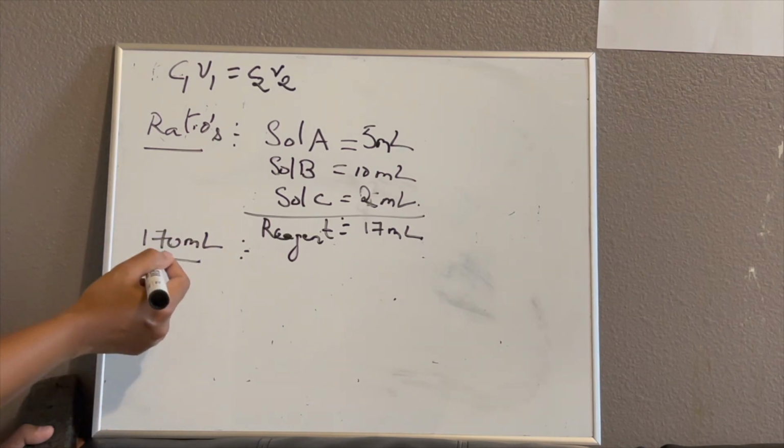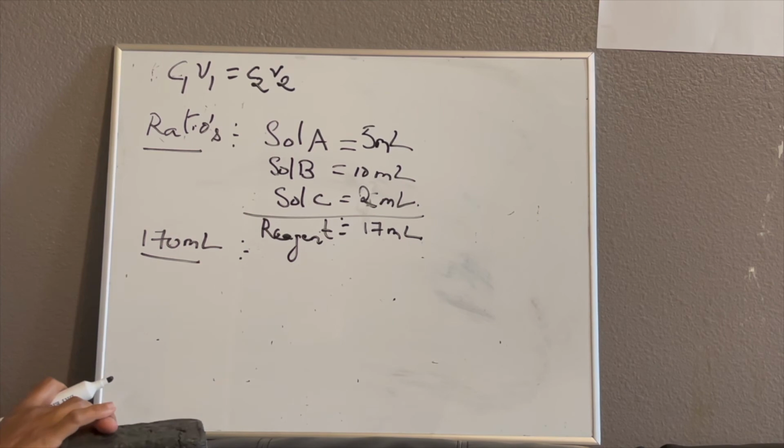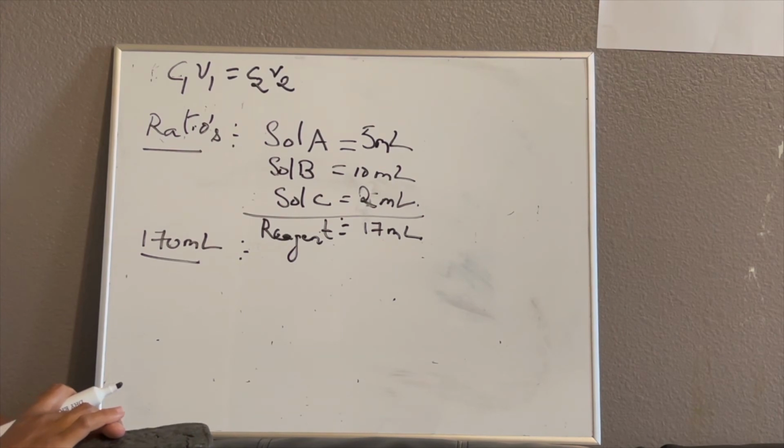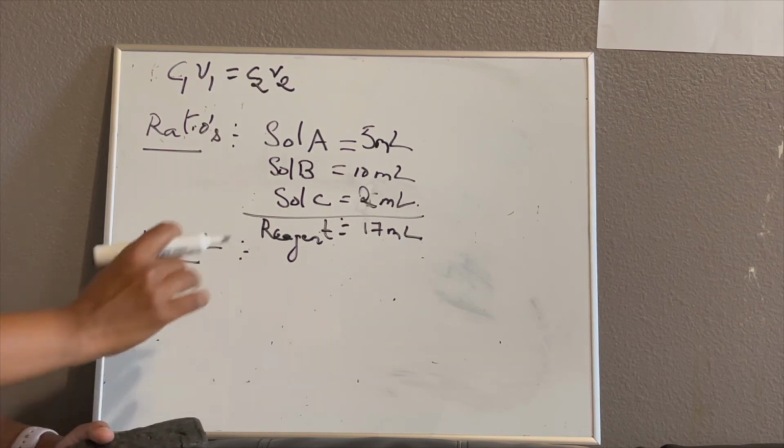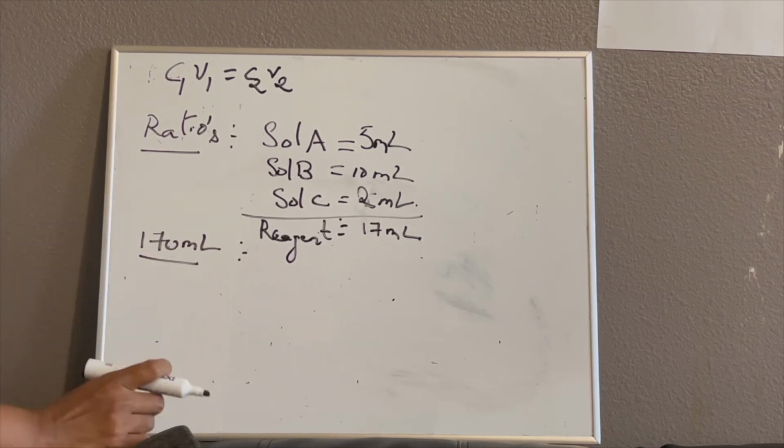And one more thing is the detection reagent. When it comes to detection reagents, sometimes they are very temperature sensitive. So for your assay to work, they should be at room temperature, but their storage condition will be 4 degrees. So it's always important to take them out from 4 degrees and keep the required amounts at room temperature.